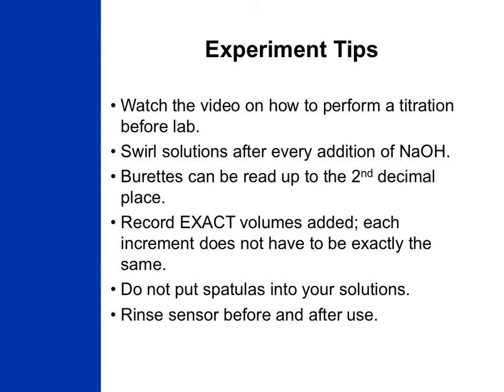Properly and consistently mixing solutions is important when performing a titration. We want to disperse each drop of sodium hydroxide throughout the whole solution quickly and evenly as we titrate. Do not let the drops fall directly in your pH probe, as this will cause a change in the recorded pH. As titration is an analytical technique, it's important to record the exact volumes you add to your lab notebook and use those exact values when performing your calculations.